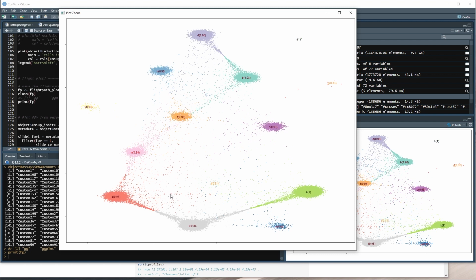This is also a two-dimensional representation, but we can see that between D and B there's this trail path. As it gets closer and closer to the center, the assuredness that the cell belongs to cluster B drops, and at some point it will flip to being part of cluster D.